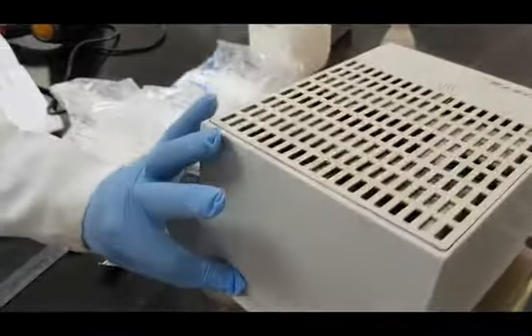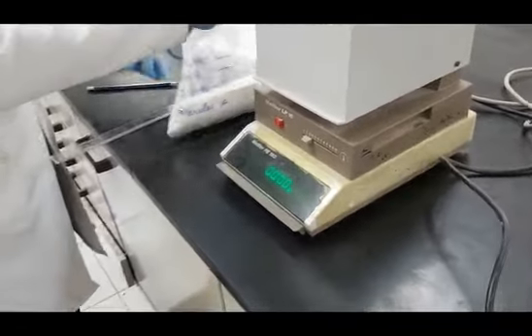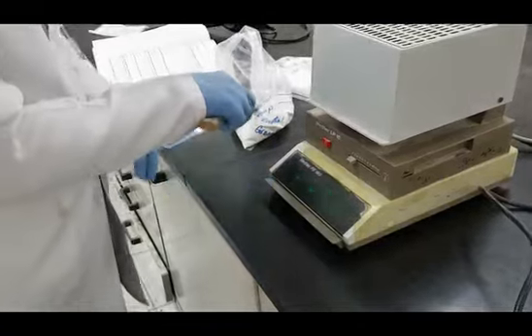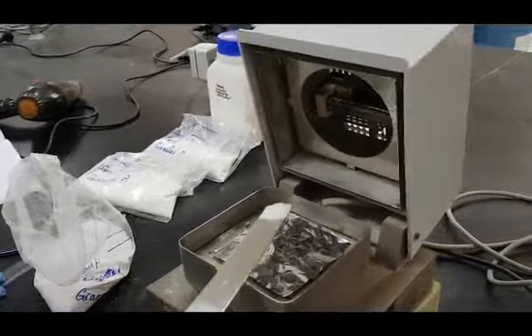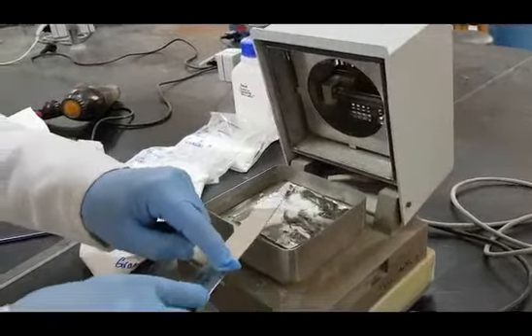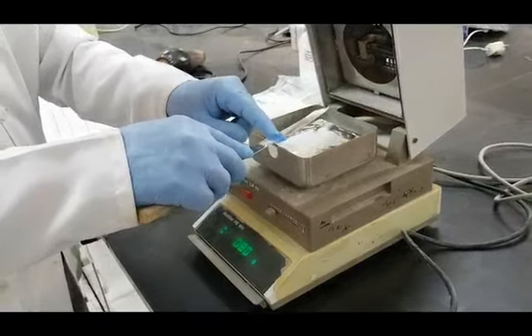Now place the square of tin paper on the balance of the moisture content apparatus and measure 1 gram. Make sure to spread it carefully in a thin sheet. This is done to guarantee uniform and complete drying of the sample, as we are measuring the dry weight.